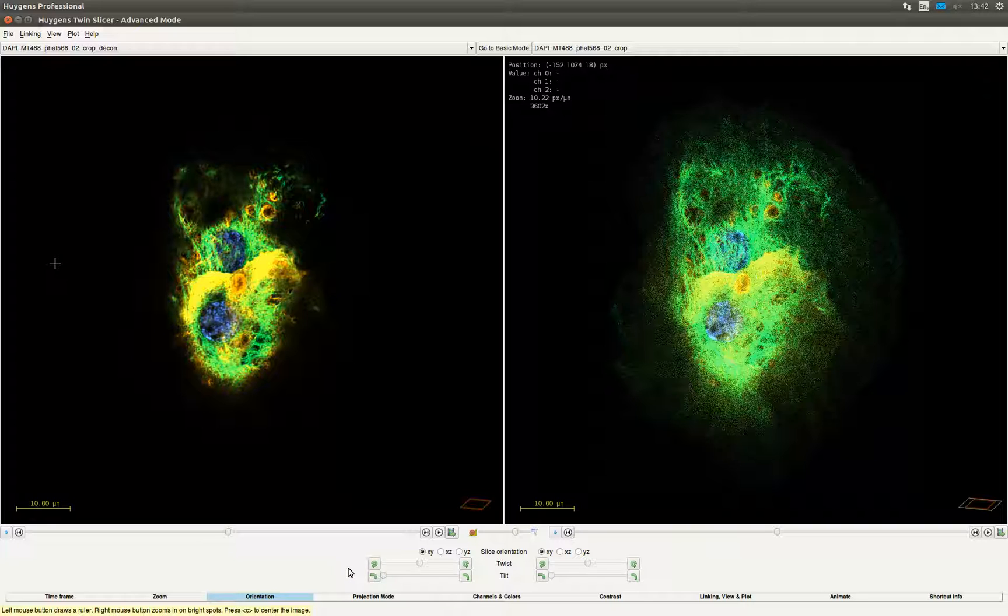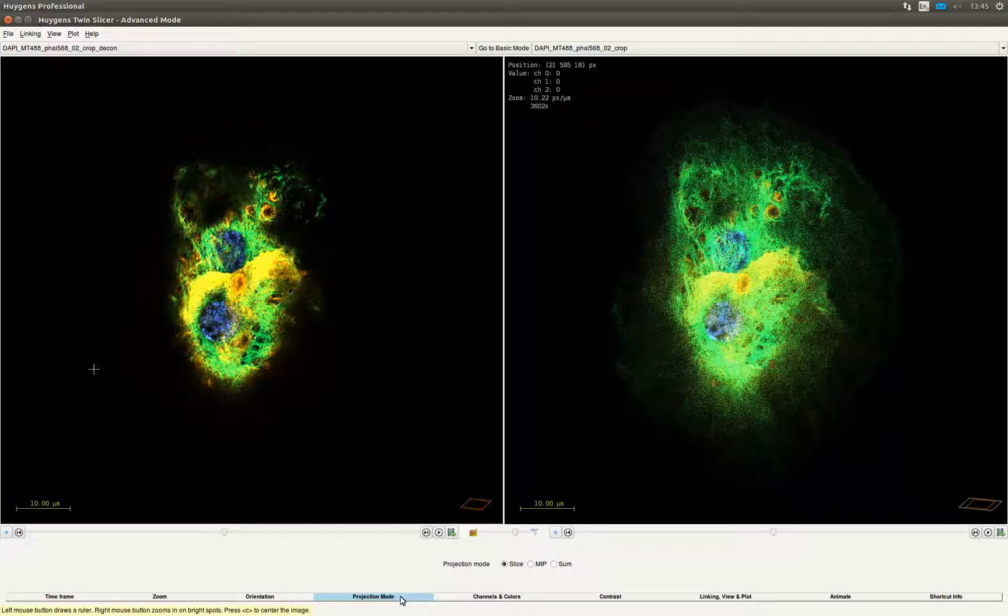In the orientation tab you can select in which orientation you want to slice through the image, besides twisting the images and tilting it. In the projection mode tab, the default is set to slice view for slicing through the Z-Stack. It is also possible to show a maximum intensity projection or the sum of all slices.